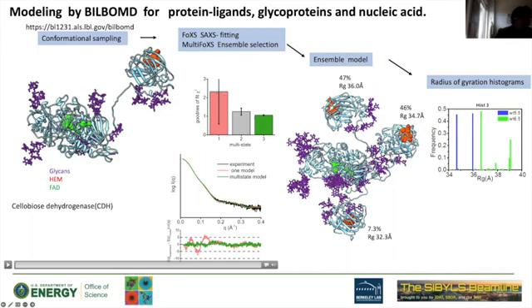And when you add the conformers, you potentially improve the match to the data. You see it in the residuals when you use a multi-state model. I think in this case there are 3 models shown on the right side. You can use this kind of modeling tool to look at different conditions. In this case, Bettina was looking at different pH, and how flexibility is affected by pH: at lower pH you see much more compact conformers, and the frequency of compact conformers is higher at the lower Rg versus at the higher pH.